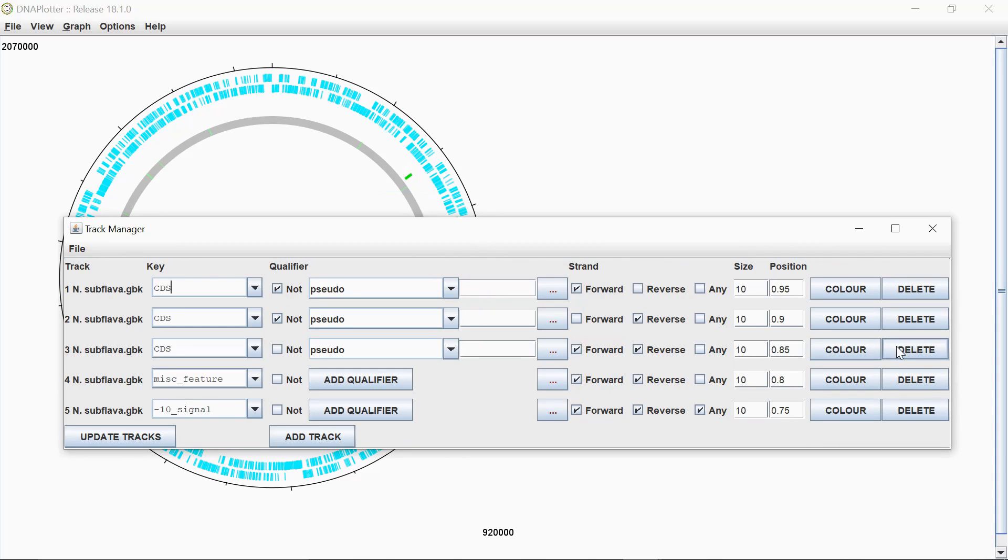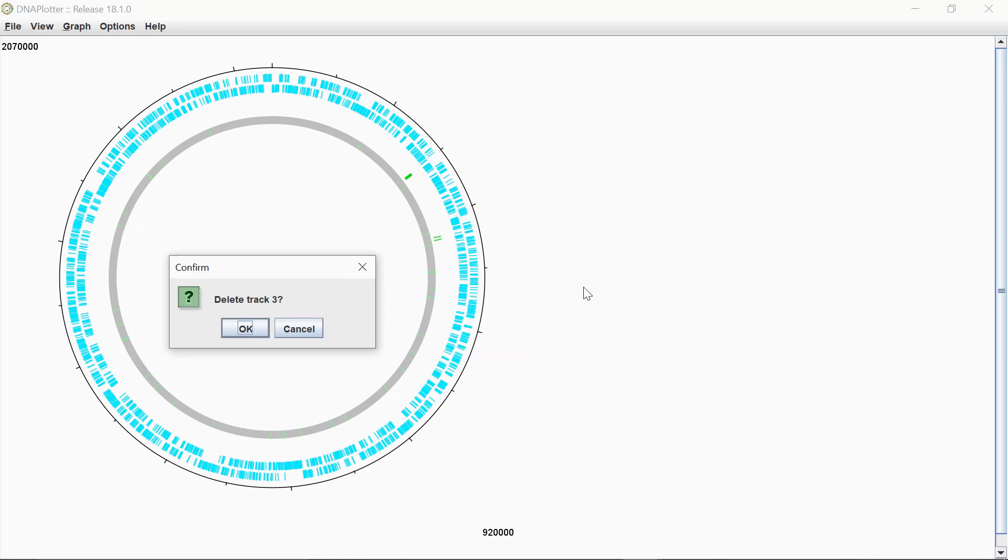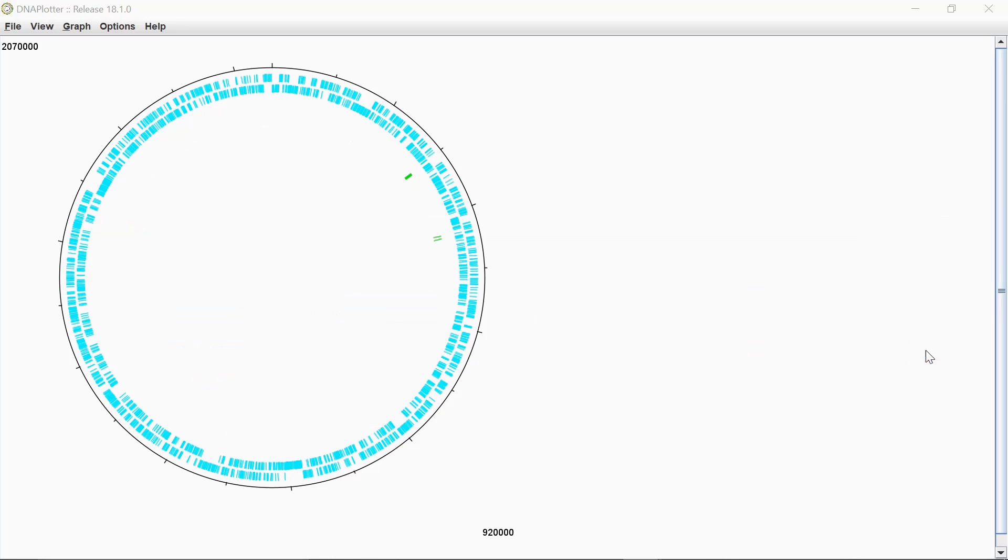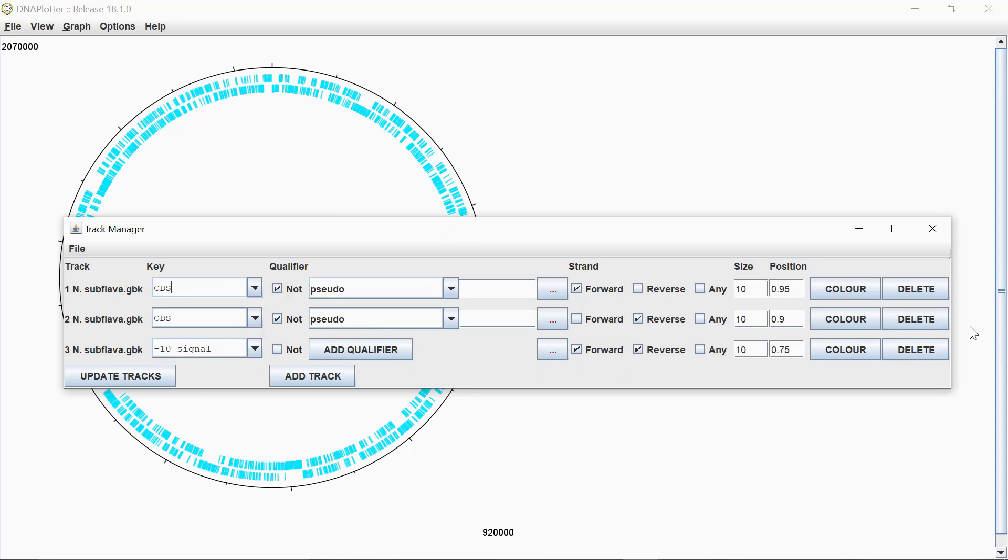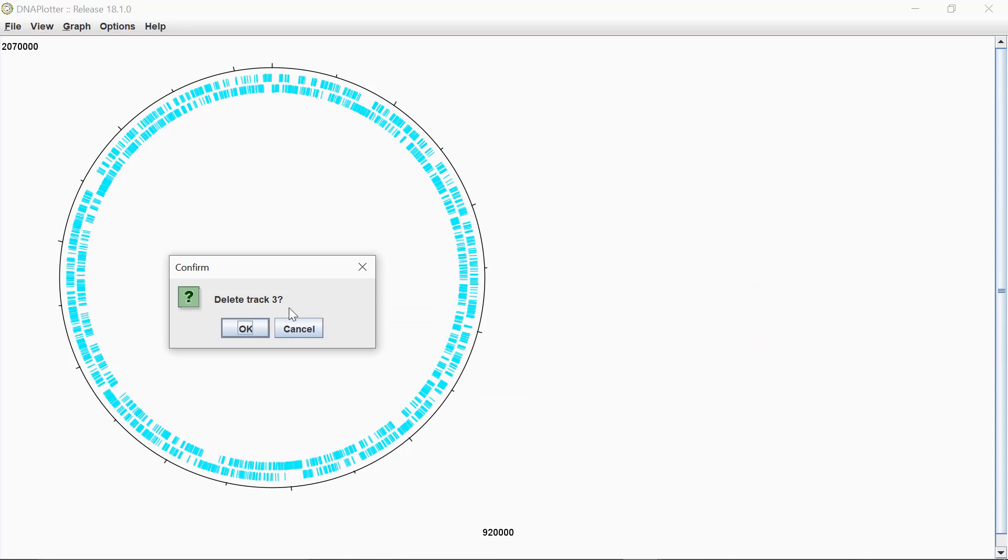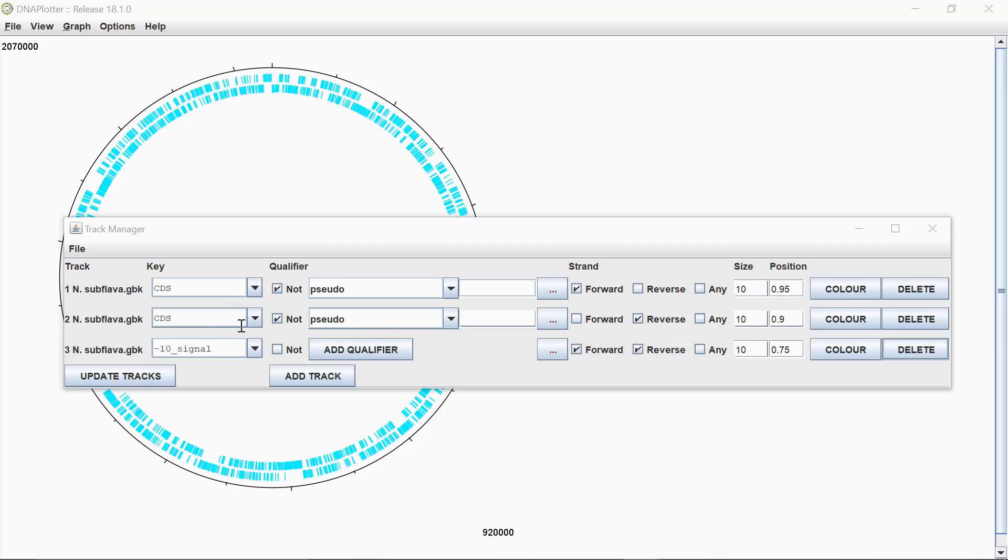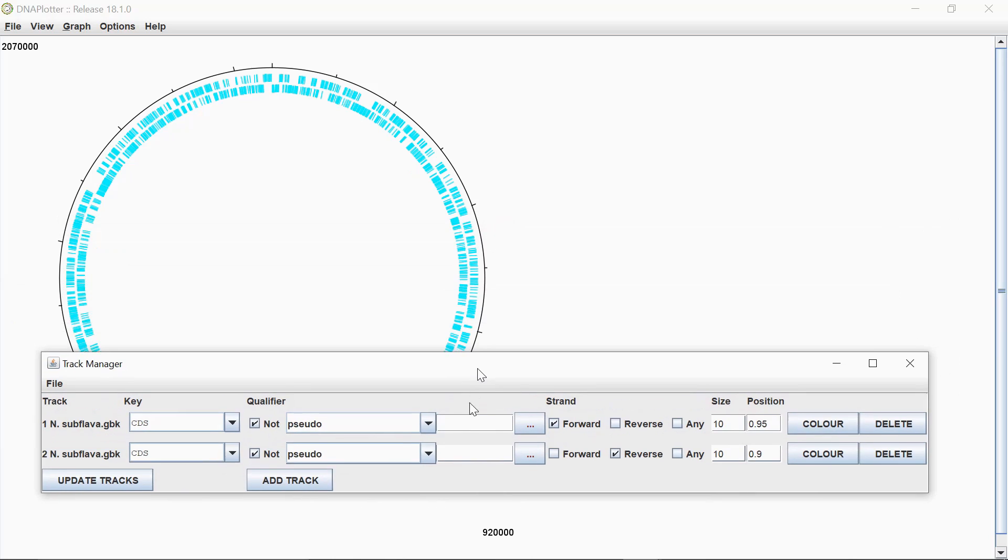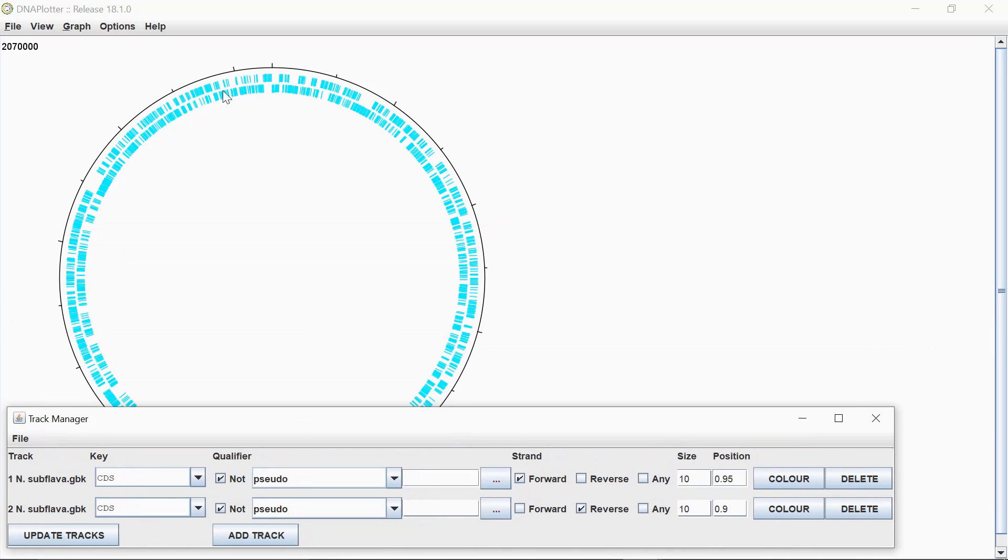I just want to look at the genes on the forward and reverse strand. So I can actually delete some of the tracks that I don't need. So I'm going to delete track three. Here. And here. So what I'm left with now is just an image that looks like this.